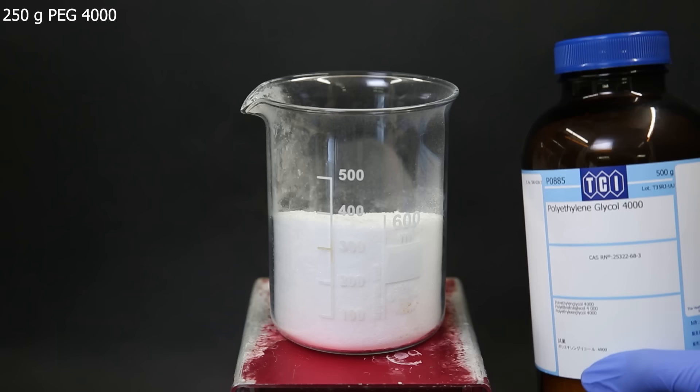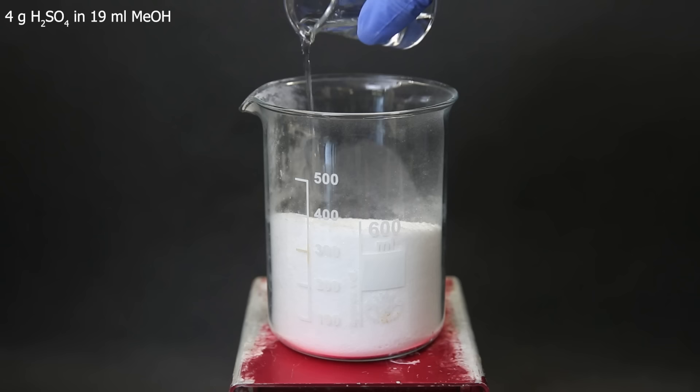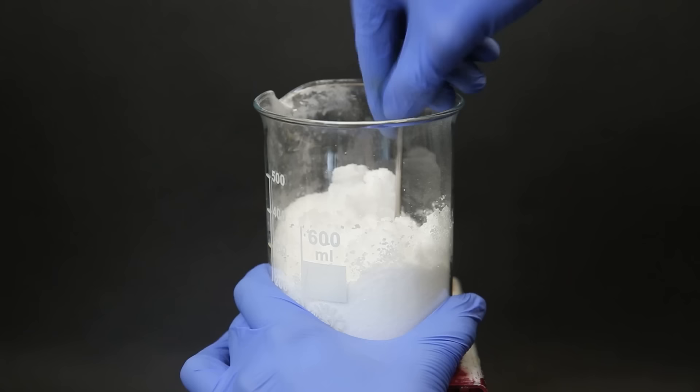To get started, I set up a beaker in which I have weighed out 250g of polyethylene glycol 4000. To this beaker, I add in a mixture of 4g of sulfuric acid in 19ml of methanol. Now I mix it and try to spread it around as evenly as possible.